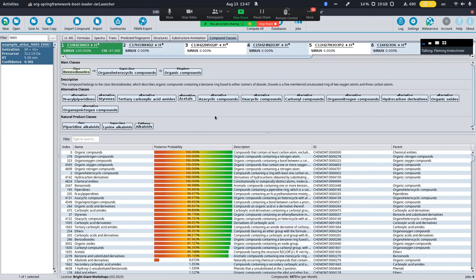Okay, now we went through one example, and because we do not have infinite amounts of time, maybe we're just going to skip the next example and directly go into something that has more to do with the tasks that we also have for this data. These compounds that we found now, piperine and piperidine, are related to pepper, and probably the reason that we find them here is that the person from the sample has consumed something with pepper taste.